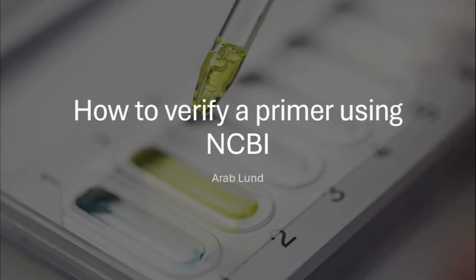Let's learn how to verify a primer using NCBI. Most of us want to use a primer from published articles or suggested by our friends who already use the same primer. But we usually make a mistake.